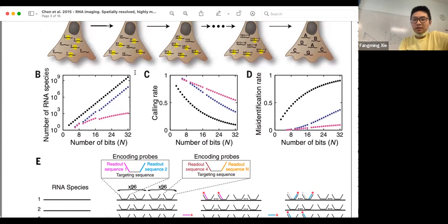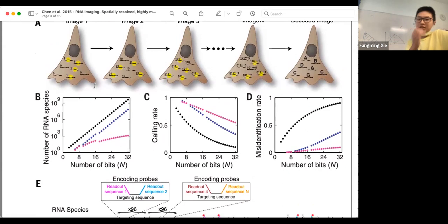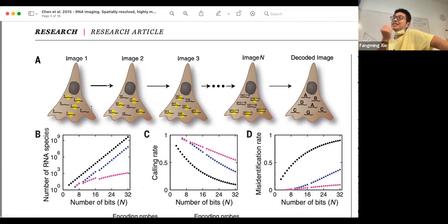So let's think through the argument we had. If we take a combinatorial barcode with 2^n possibilities, you assign each different gene with one barcode from this 2^n, will that work? In theory, it should work, but in practice, they don't. They kind of want to show it here. Why in practice they don't? Because technologies are never perfect. In each round of imaging, you have a small amount of error, say 90% accurate, 10% messed up. For single molecule FISH, it's okay, because you still get 90% correct. But for this kind of thing, errors accumulate in each round, so that in the end, if you have 10% error here, 10% error here, 10%, then the signals bleed into each other, you never resolve anything in the end. That's what they want to show you.